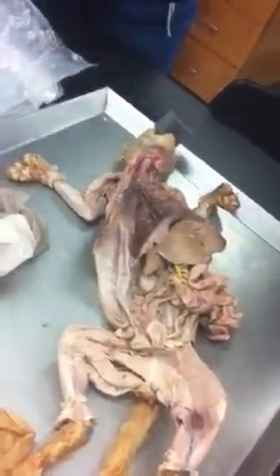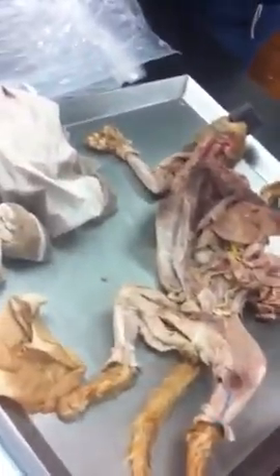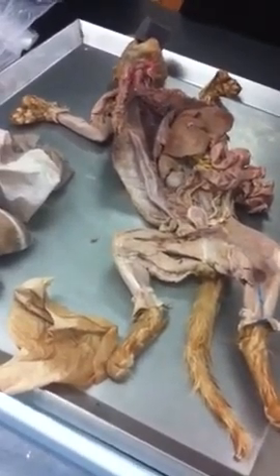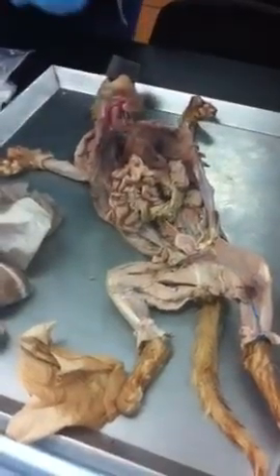And when we got out our superior mesenteric artery and our celiac trunk, all that really tough threads of tissue that you might have seen, that was ganglia too. So there is a plexus of ganglia associated with each of those big trunks coming off of the descending abdominal aorta. Let's look at the heart real quick.